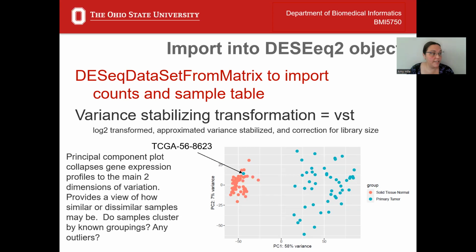If you had a data set that had 3 tumor samples and 3 normal samples, and one of your tumor samples was maybe out here, then in that case, I would not remove it, because you already have a low sample size and it's only slightly over that way.